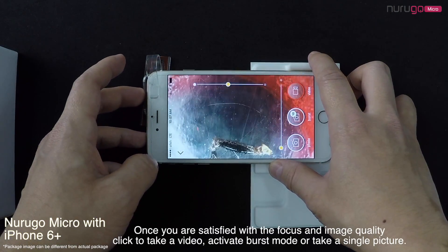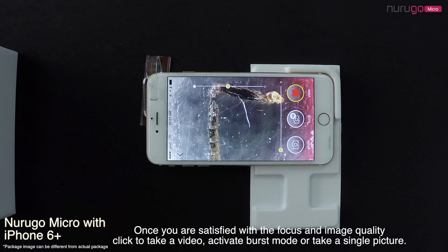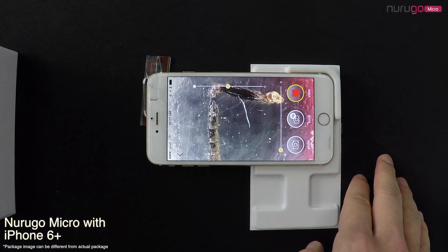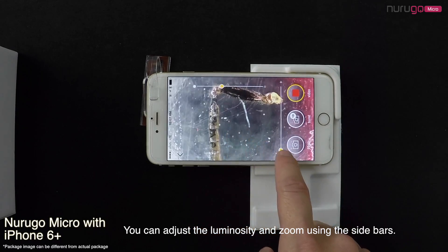Once you're satisfied with the focus and image quality, you can click to take a video, activate burst mode, or take a single picture. You can adjust luminosity and zoom using the sidebars.